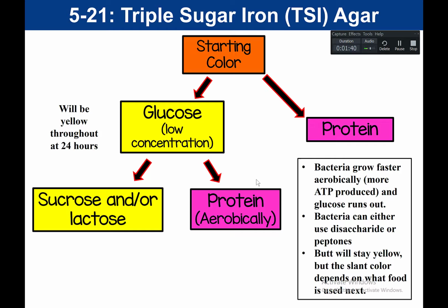So this part that we've discussed does not yet look at the sulfur reduction. This is only looking at the sugar component, right? And so when you fill out your biochemical sheet, in addition to the one for the sulfur reduction, you want to have a second one that has the sugar information. And that is that the substrate would be glucose and or sucrose or lactose, right? Those would be our substrates in our test.